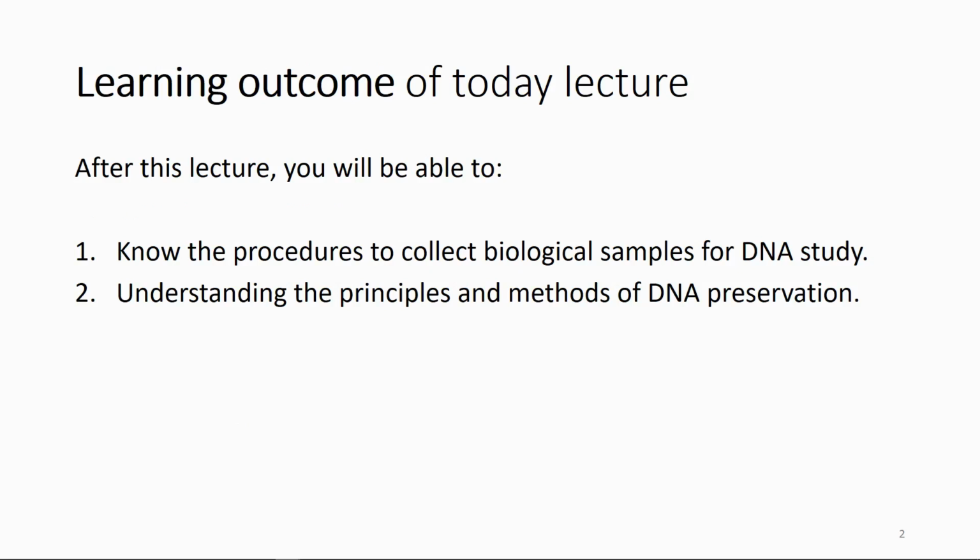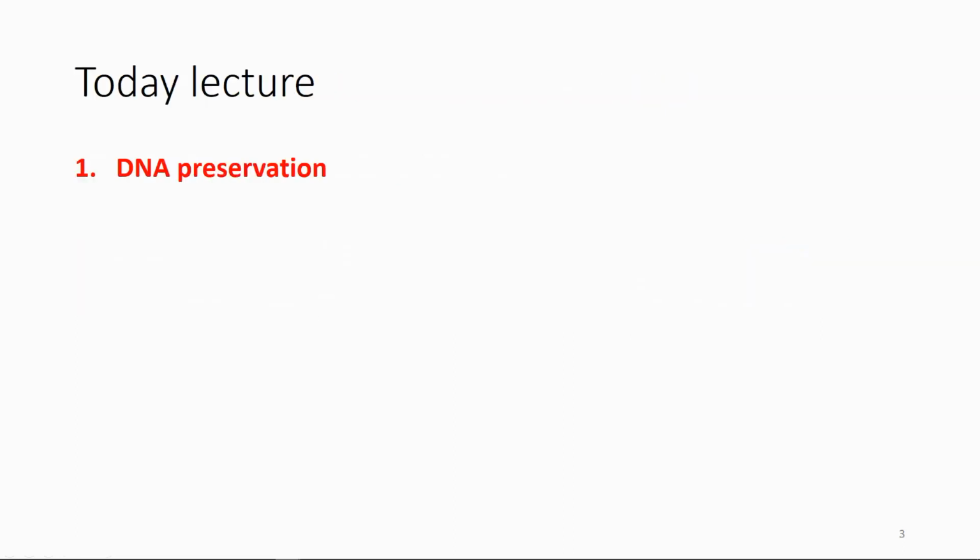After this lecture, you should be able to know the procedure to collect biological samples for DNA study. So you have to know the procedure and also understand the principle and the method of DNA preservation. So, the procedure for DNA preservation.